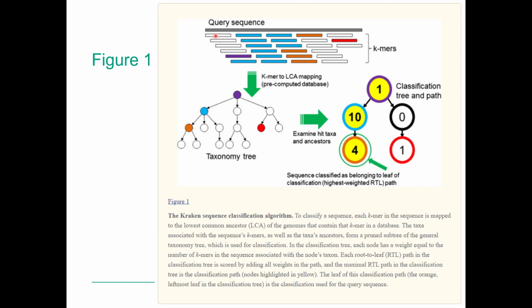First, these white k-mers here are new. We haven't seen them before, so they are not assigned to any taxid in the database. This happens because the database doesn't contain everything in this world. We can have sequenced something new, a new organism that we have never seen before, and it will have some pieces that we haven't seen in our database. So the white ones here are unclassified.